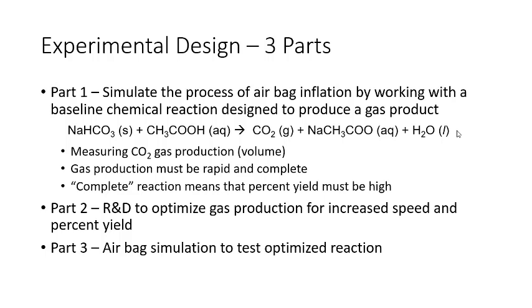In part 2, we're going to do an R&D. You and your partner are going to work through R&D to optimize this reaction for increased speed and percent yield. In this R&D step, you're going to have an opportunity to switch to different types of acids, different types of carbonates, and different concentrations. And we'll go over those in lab.